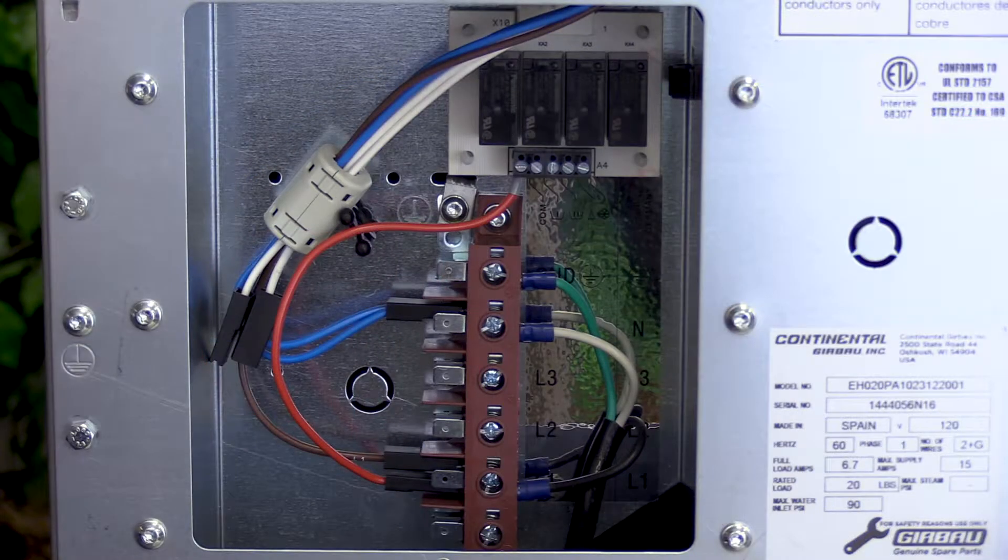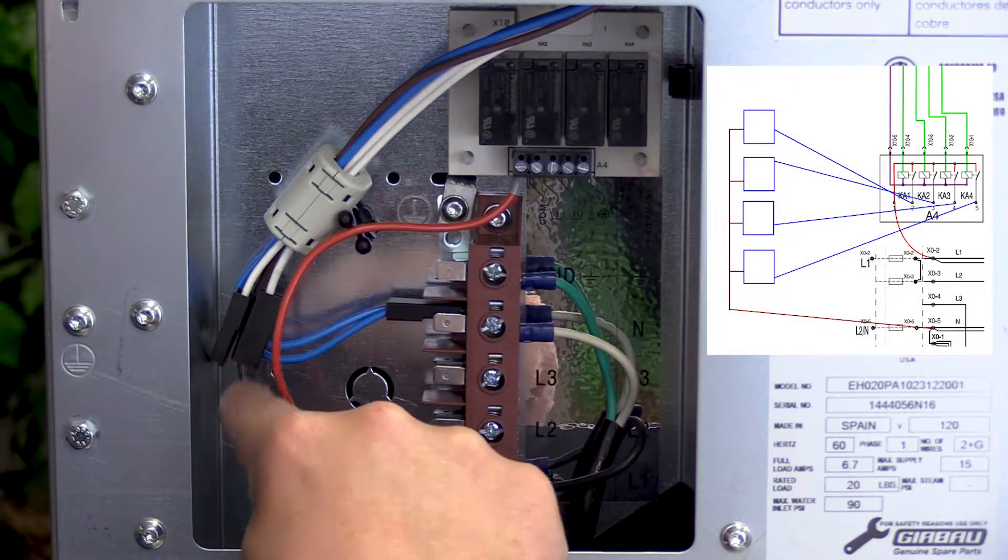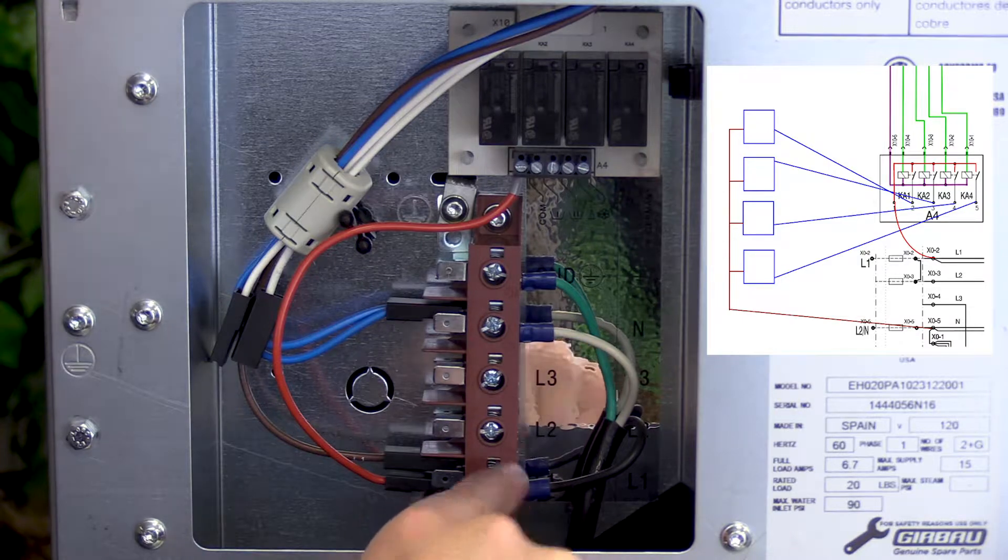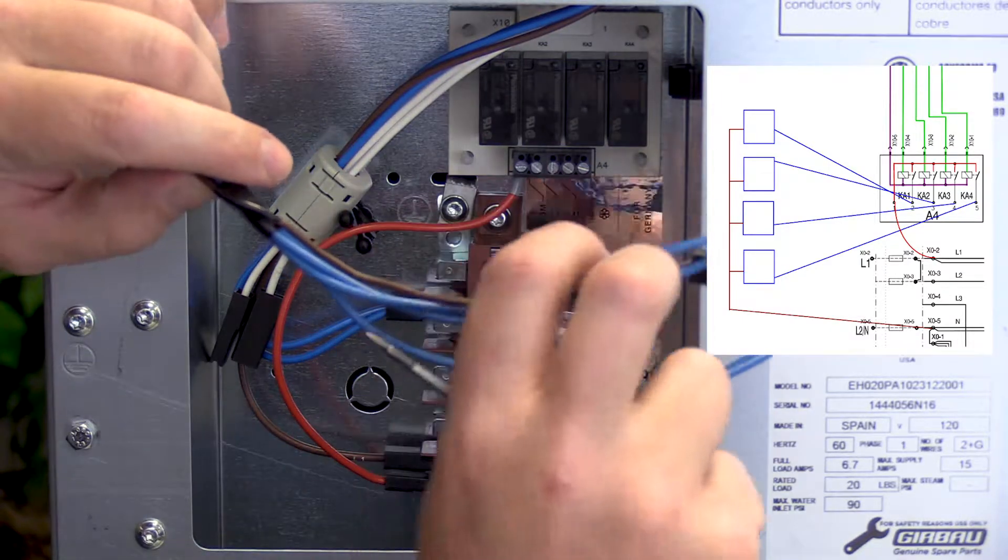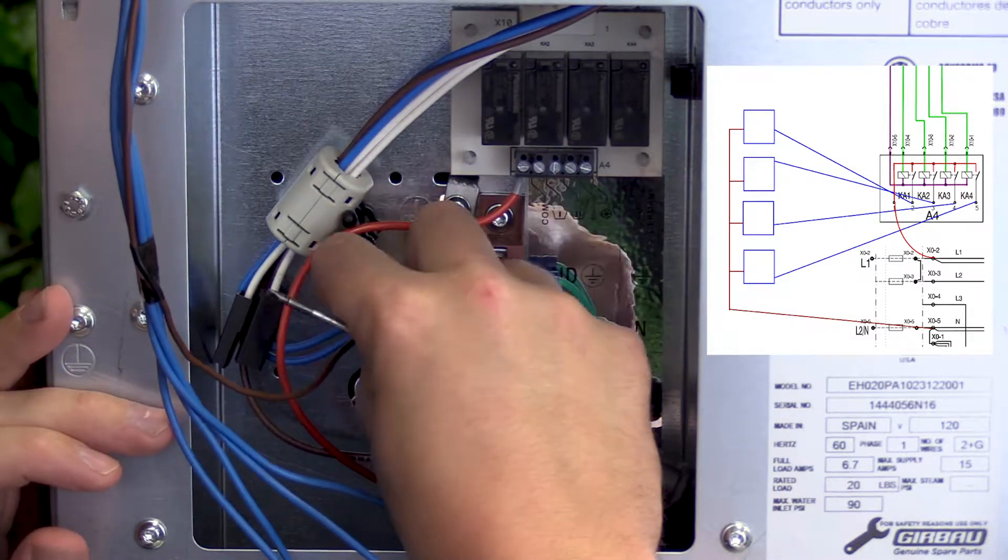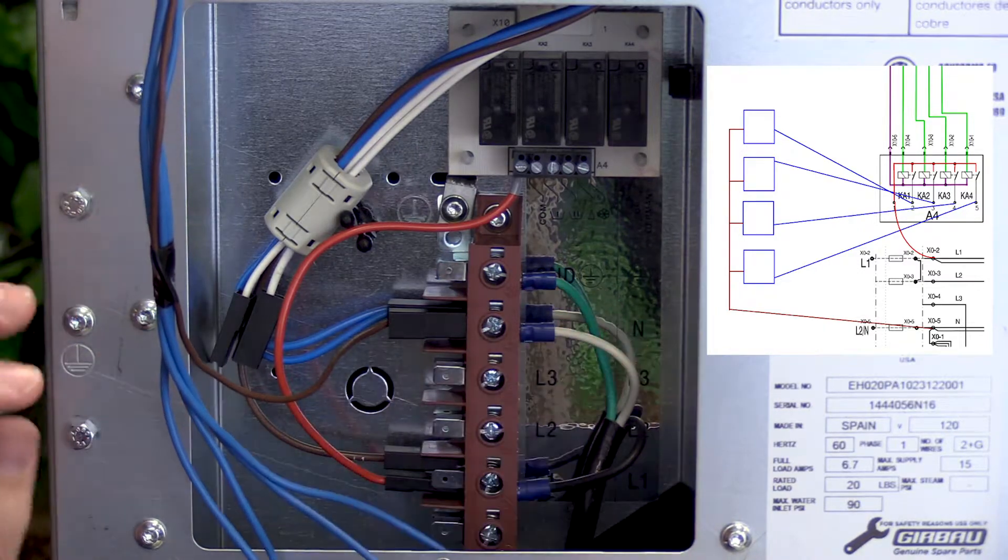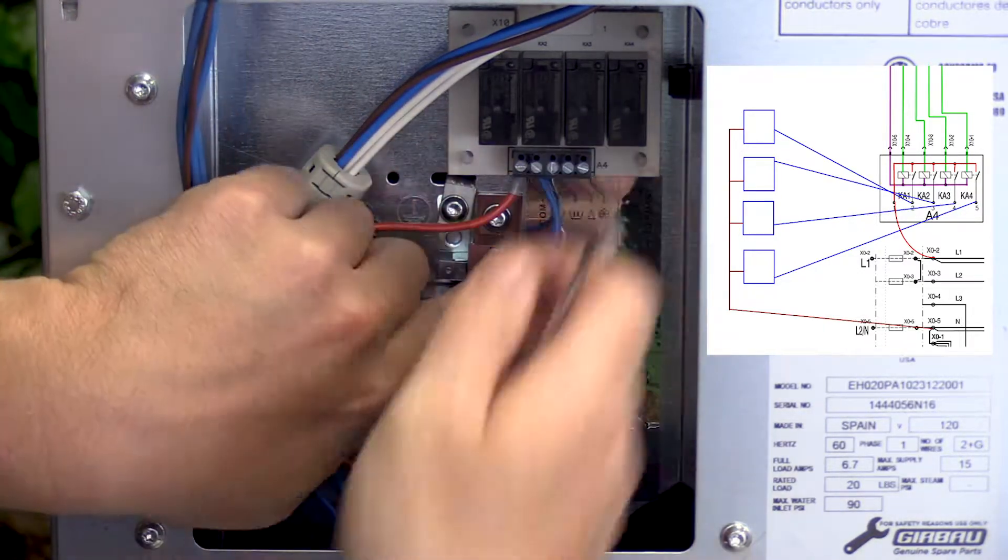Verify the jumper wire is connected on L1 from the input power terminal block to the power common on the external chemical terminal block. This will provide 120 volts AC to the dry contacts of the washer.